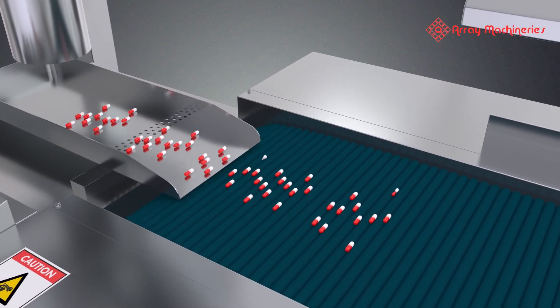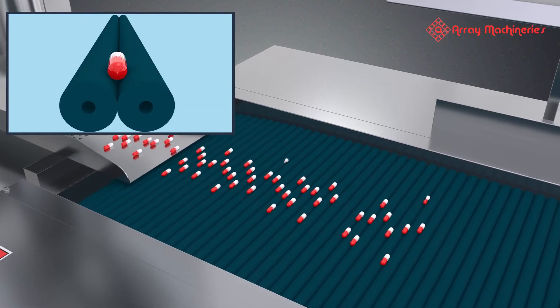In the inspection area, the tablets rotate 360 degrees for detection of any defects.